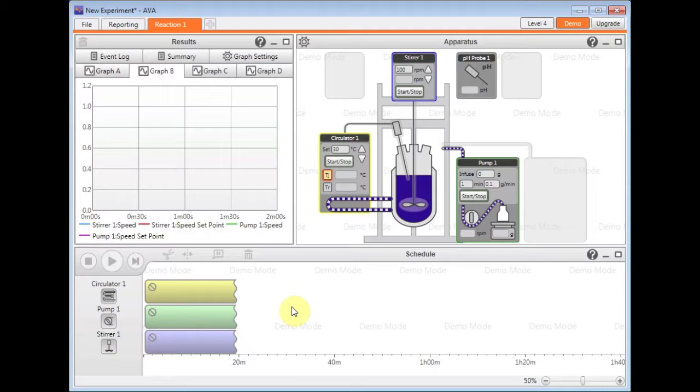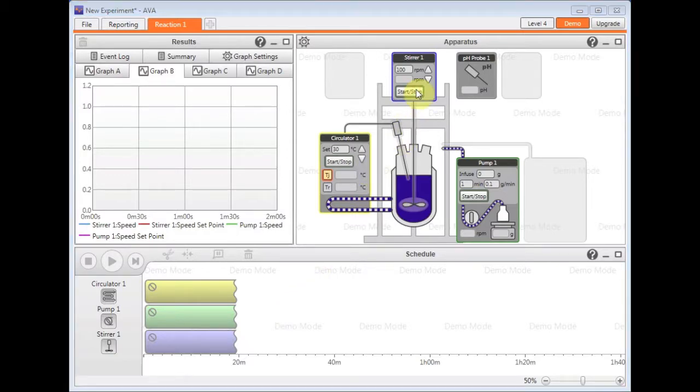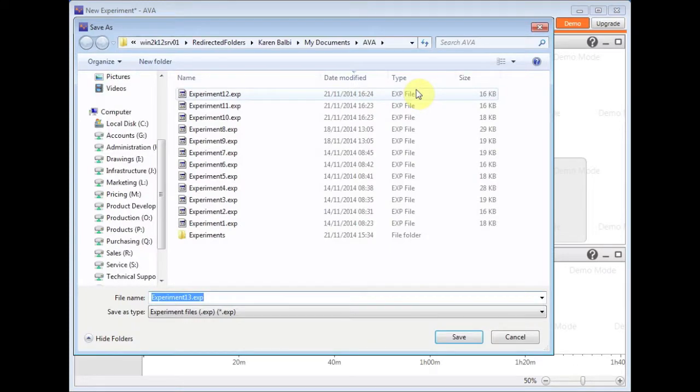To begin with, I'm going to show you the control from the apparatus window. To start the apparatus control, simply click on the start stop button within the apparatus window for the device itself that you wish to start. This prompts you to enter an experiment name for the setup and data that's for this file.